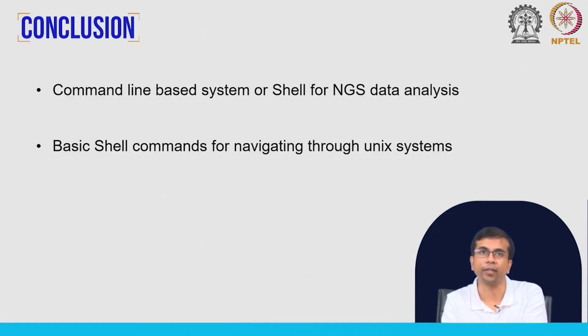And to finally summarize, we have seen that we will use a command line based system or shell for NGS data analysis, and I have mentioned how you can set up this shell in the case of Windows based systems. In Linux and Mac, you have the terminal already available, and we have also discussed some of the basic shell commands that allow us to navigate through this Unix system. And in the next class, we will discuss a few more commands that will be very, very helpful.